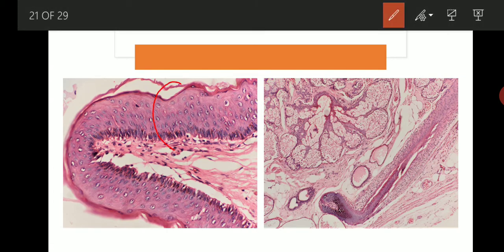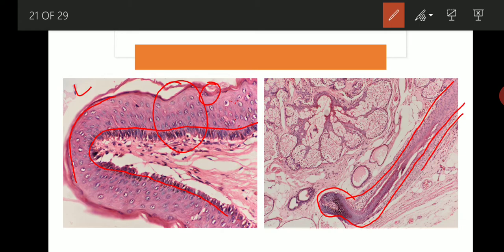You can appreciate the squamous epithelium better here, the stratified squamous epithelium having a basal row of melanin containing cells. This is the lumen, and the surface contains these granular cells, and the 4 or 5 layers of the squamous epithelium are evident. In addition, you see hair follicles, because this tumor can contain a lot of hair.